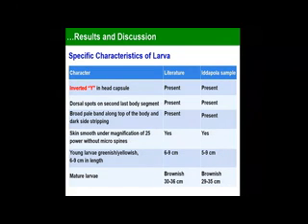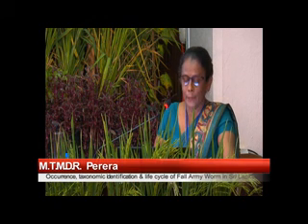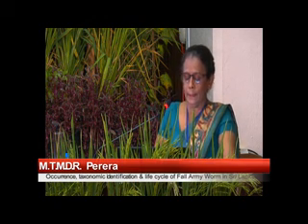Number 6, skin smooth under magnification of 25 power without microspines. Normally, other Spodoptera species have microspines, but this doesn't have microspines. Young larvae greenish, yellowish, and 6 to 9 centimeter in length in the literature, but ours got 5 to 9 centimeter length. Mature larvae brownish, 30 to 36 centimeter. Our sample was brownish, 29 to 35 centimeter long.